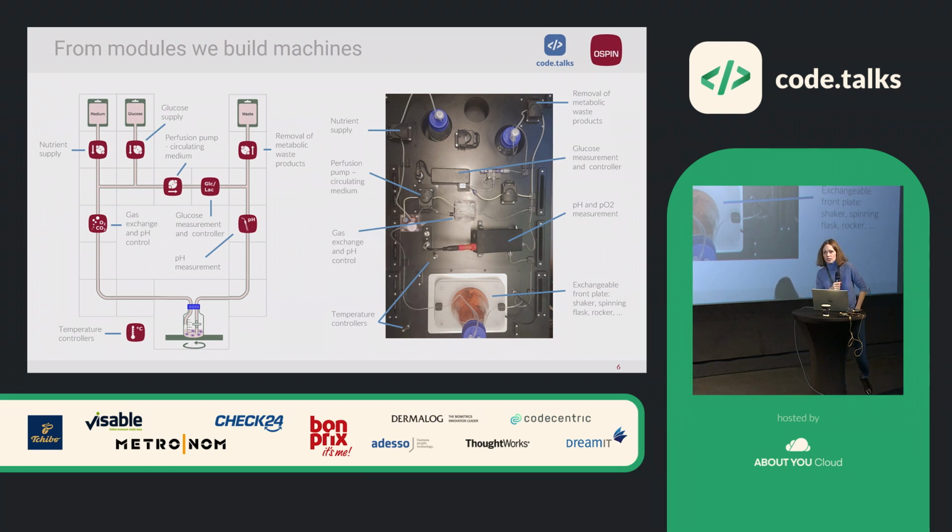Why are there so many manual steps involved in the whole process? Isn't there some kind of standard, ISO standard or something, where this could be automated? You mean that I need to configure the process manually? So you mean if you cannot have a standard process? Yes, so for me it sounds like there has to be a person who needs to connect this pipe with this and so on. Isn't there something a robot could do for you?